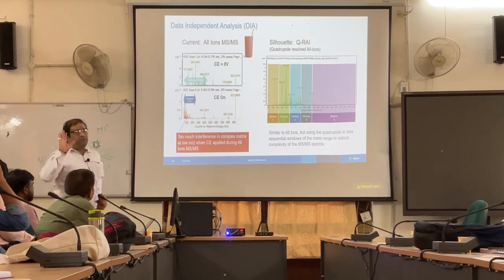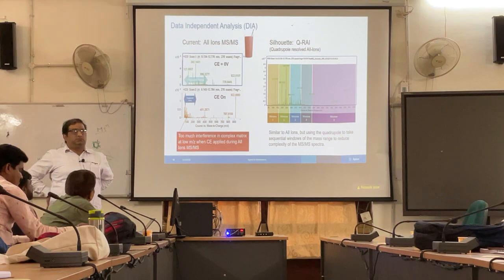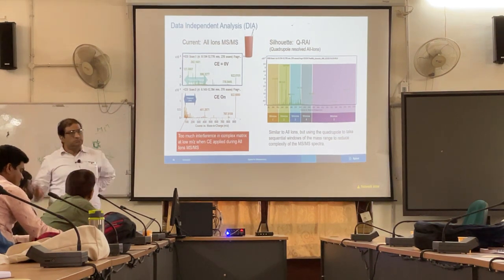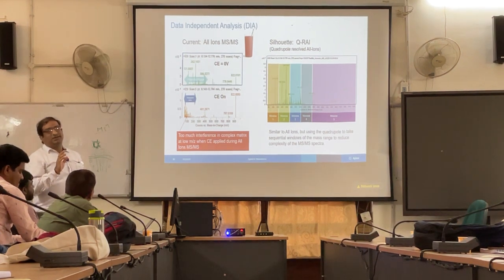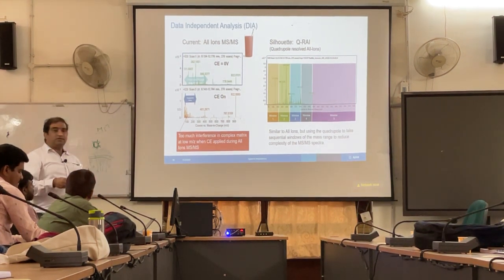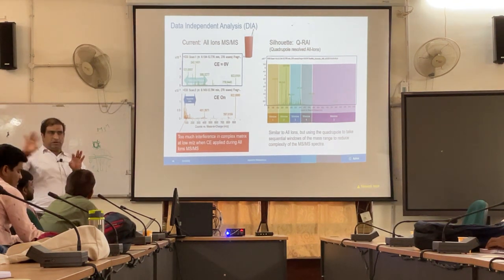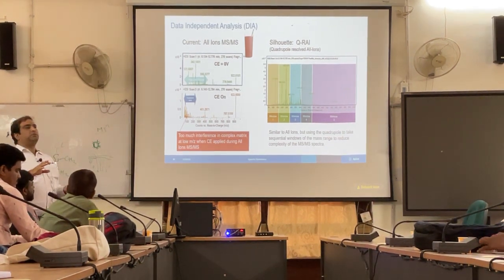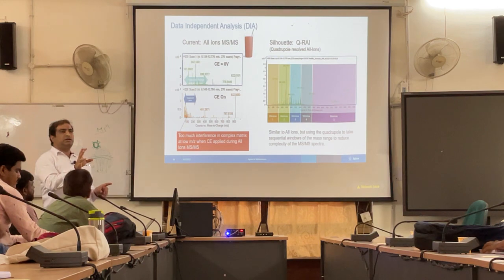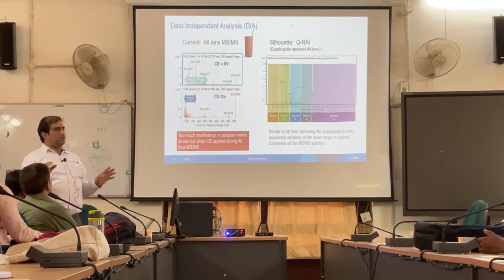So what is the first step for doing MS/MS match? You have to do MS/MS, correct? So how do you do MS/MS? First step of doing MS/MS is to isolate the molecule in quadrupole and then do MS/MS. So one molecule at a time you will get, and you will do MS/MS. But this is okay with your limited analytes. If you have 20, 30, 40 compounds, all okay.